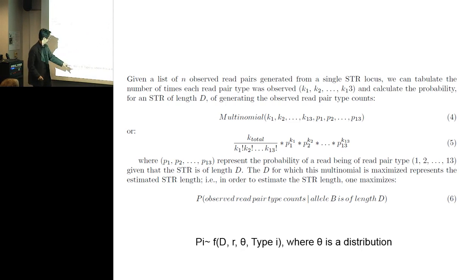with another complication that theta now is not a singular value, it's a distribution. When people send data, you ask for 300 nucleotide sequencing, you actually get, say, 250 to 550 or so range. So that can be learned. I still don't quite know how feasible it is to use an empirical distribution. Right now, one implementation is to just treat theta as a normal distribution. A lot of the analysis becomes easier. Okay, so this is actually the shakiest part of the algorithm. I'll move forward, trusting you don't challenge it too much.